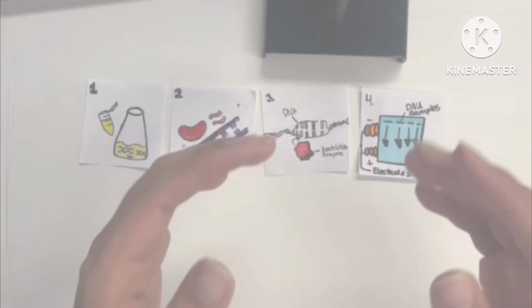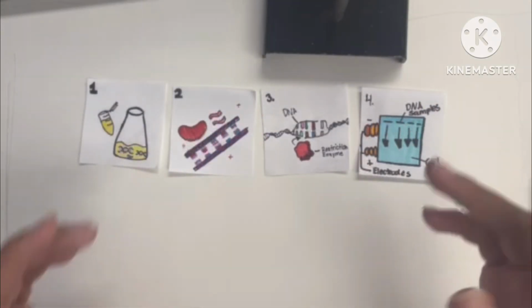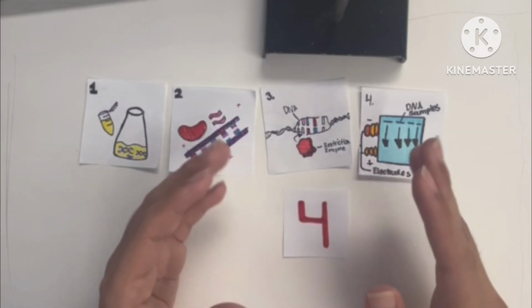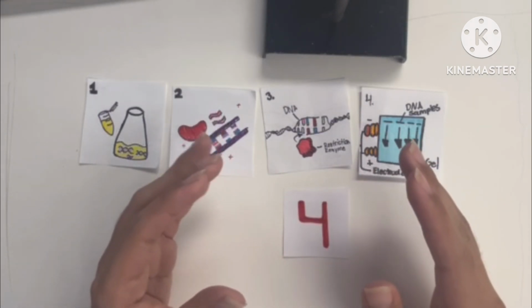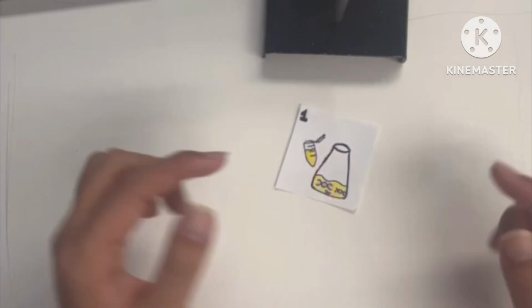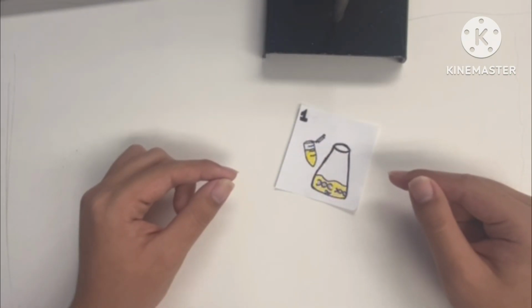Hi, I'm Sean, and I'll be explaining the 4 processes during and leading up to gel electrophoresis. I will go over each of these 4 steps individually and in detail, starting off with the first step, getting your DNA samples ready and extracting your DNA.